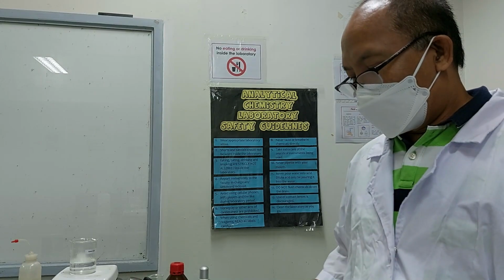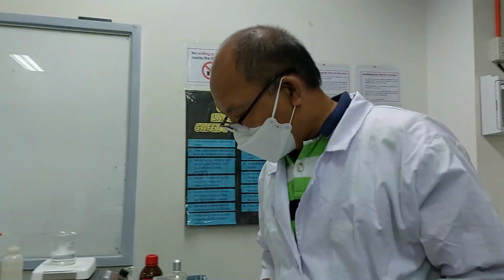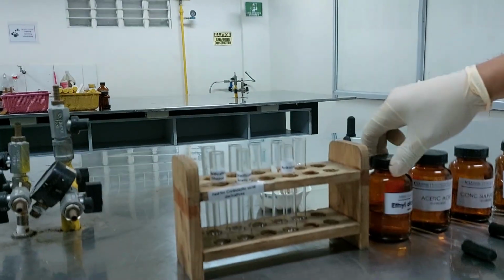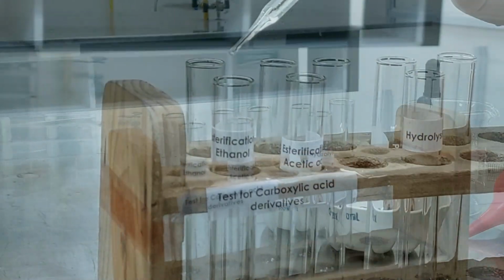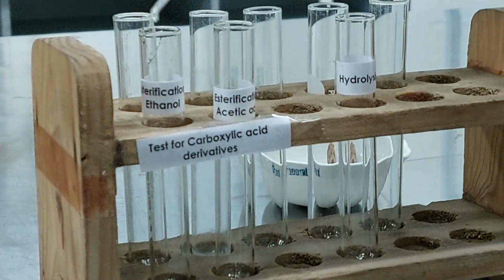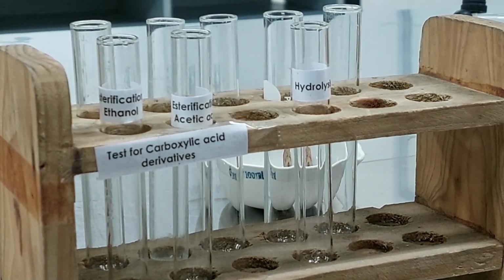So once that forms, it means to say that ester has been synthesized from the reaction of ethanol and acetic acid. Here we're going to place 10 drops of the reactants. This is your ethanol, this is your acetic acid. We're going to place 10 drops of ethyl alcohol. 1, 2, 3, 4, 5, 6, 7, 8, 9, 10. And then we'll mix this one with acetic acid.